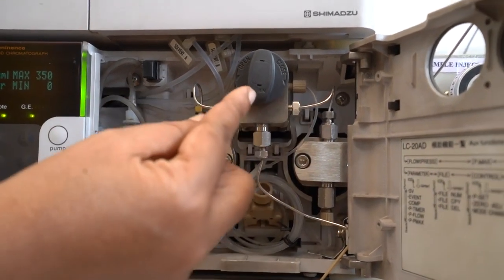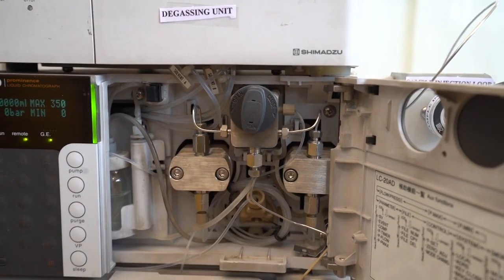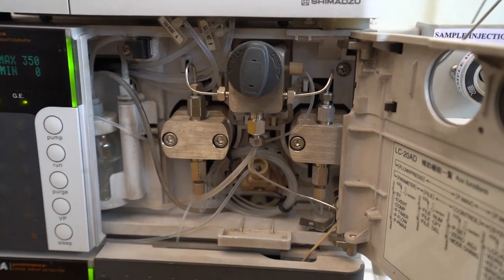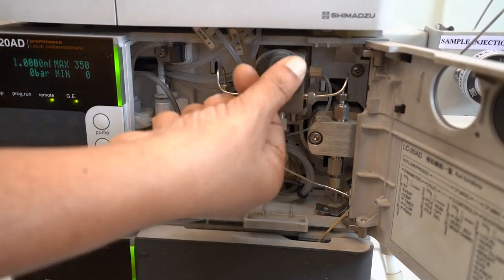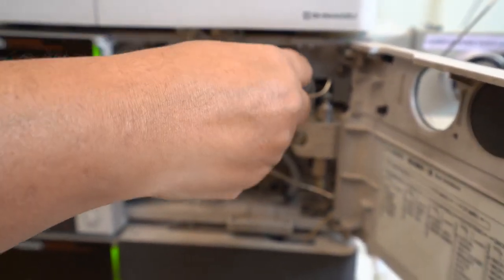What you see over here is called the purge valve. This purge valve helps to carry out purging of the HPLC system. Every time the HPLC system is switched on, it is very necessary to carry out the purging of the system. The purging of the system is carried out by rotating the purge valve in the anti-clockwise direction.